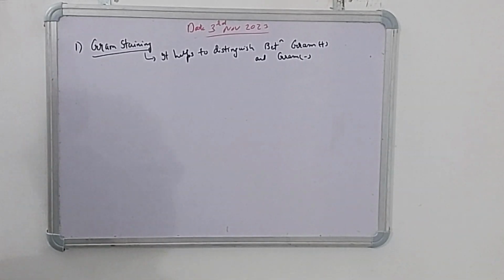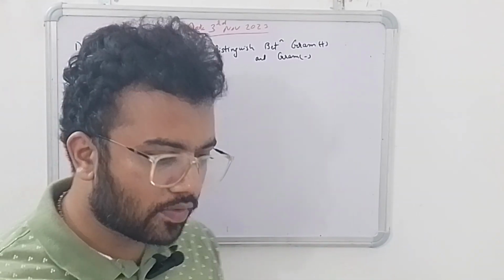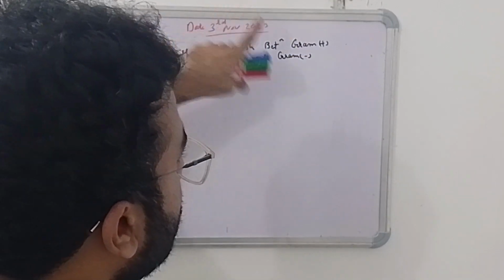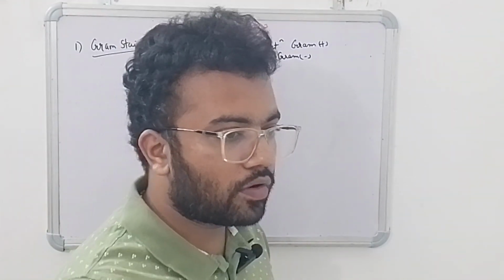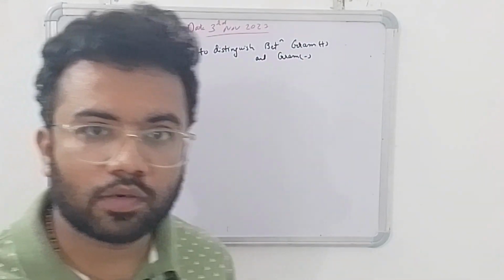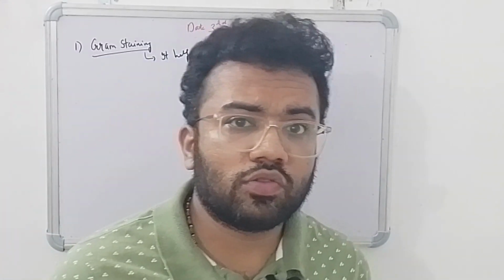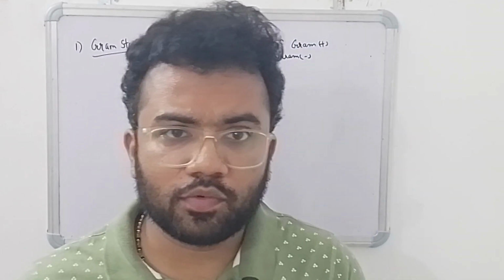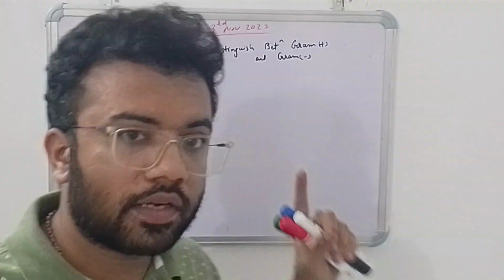Okay, so why are we doing gram staining? All things work in a process. First you do gram staining, so you know which is gram positive or gram negative. If it is gram positive, then you go for the catalase test. You know that we have cocci in a smear microscopy, and you found them in clusters or in chains. There is also a different method of distinguishing staphylococcus from streptococcus. But gram staining helps to distinguish between gram negative and gram positive.